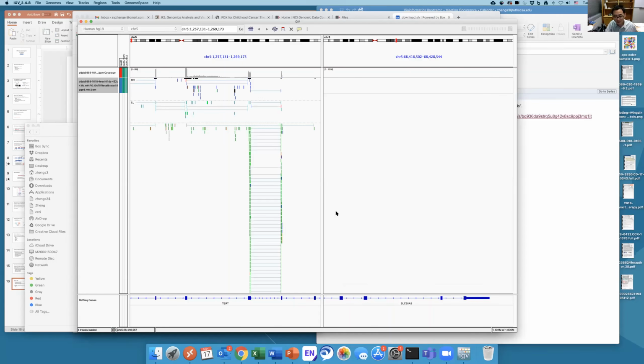So, if I click this, you can see that for this pair of reads, one is aligned to TERT and the other is aligned to a gene called SLC30A5. Now, I said I don't have reads for this region, that's why it looks so clean, but we know in this sample there is a fusion event between TERT and SLC30A5. That's how you visualize the fusion event in IGV, okay? That's pretty much it. That's really simple, once you know where to click.